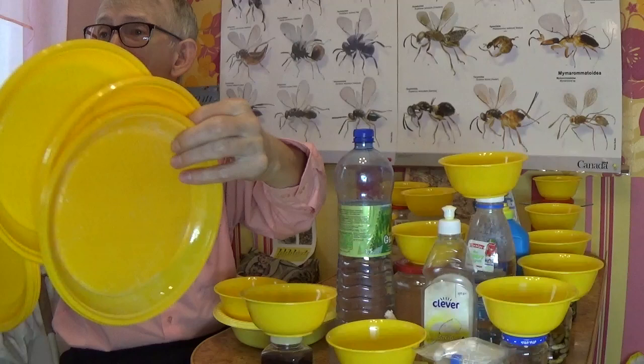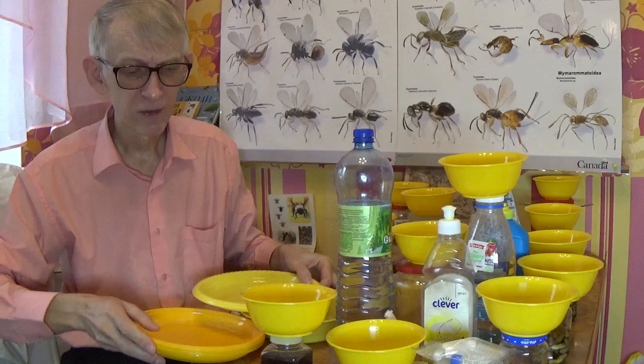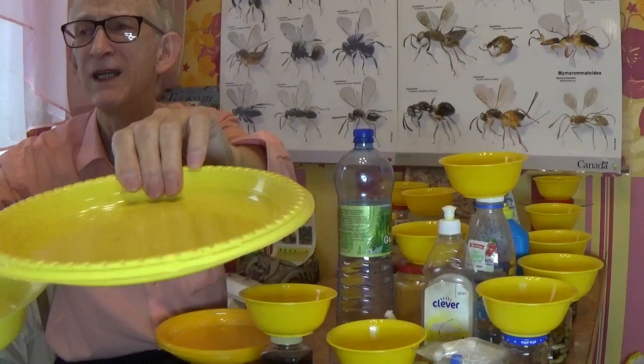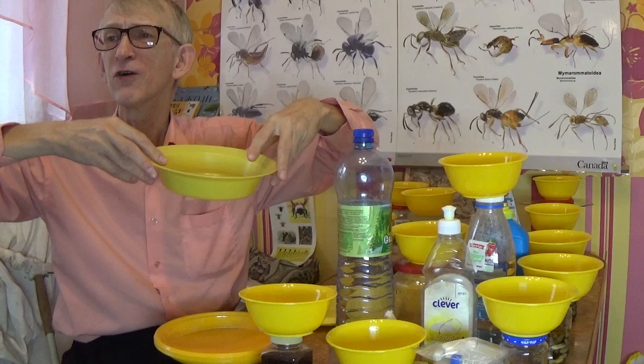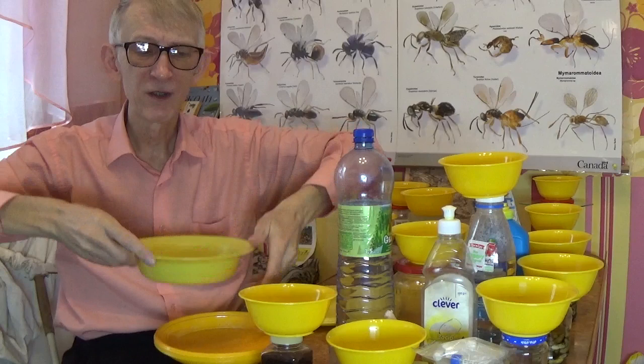First of all, you need to put these plates on the ground. Some are quite shallow, some deeper — perhaps five centimeters deep — so the amount of water will be bigger. You can put it just on the ground, or even use strings to hang it on a tree, though that's more difficult because when it's windy, the water can spill.